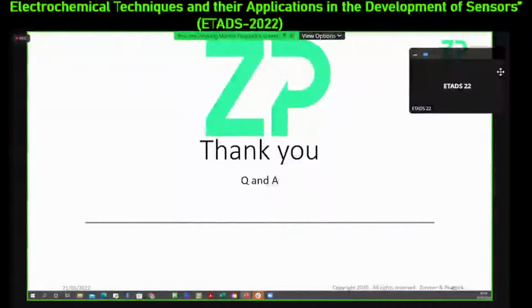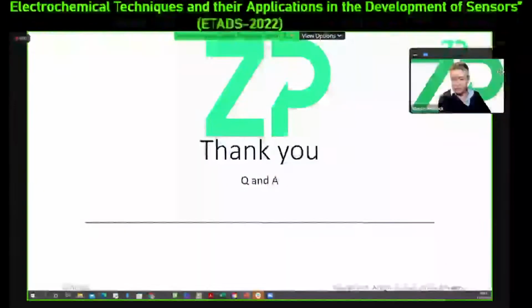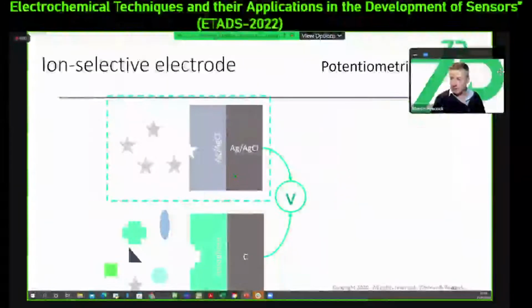Thank you. Next question is from Ritu Das, IIT Delhi. What oxygen scavenger have you used? Yeah, so the oxygen scavenger that we've used is, when Andre was doing the experiment, he poured in a little bit of powder, and the powder was a molecule called sodium sulfite.